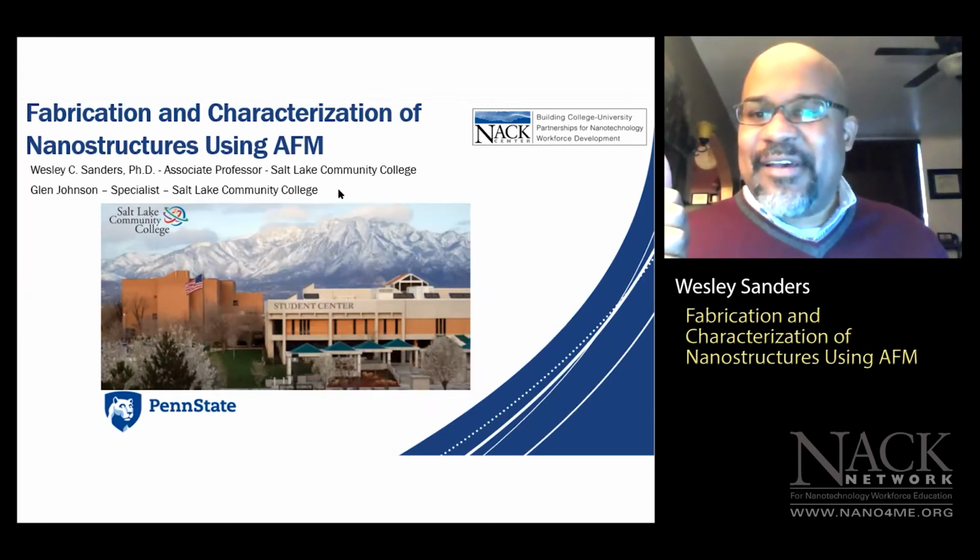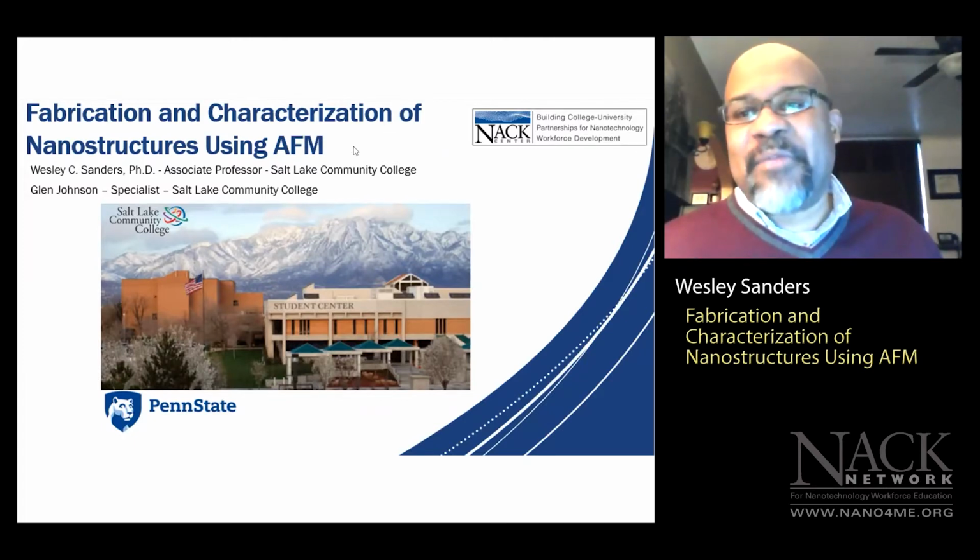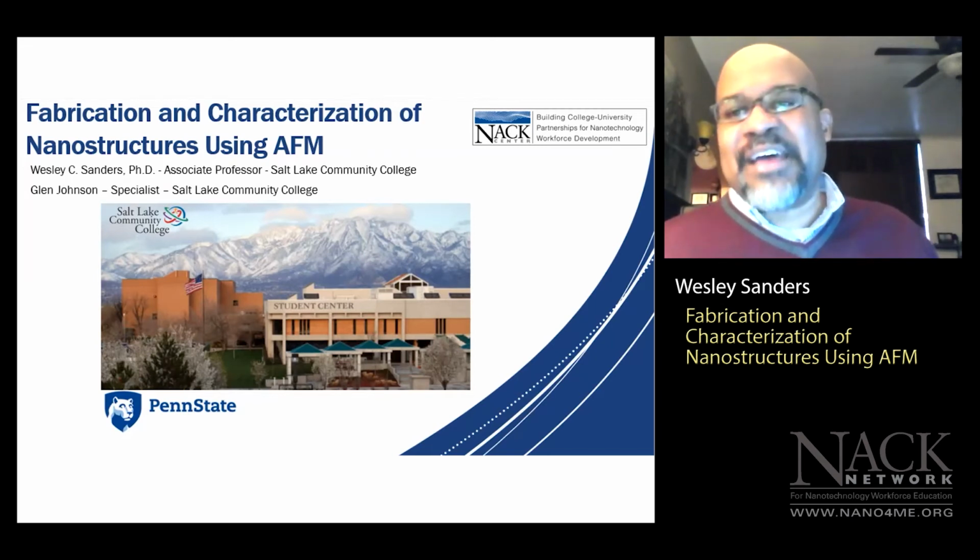All right, wonderful. What we're going to discuss today is a series of nano and micro fabrication techniques involving atomic force microscopy. Oftentimes it's necessary to use some very specialized imaging techniques in order to see the structures that are printed using this atomic force microscope.